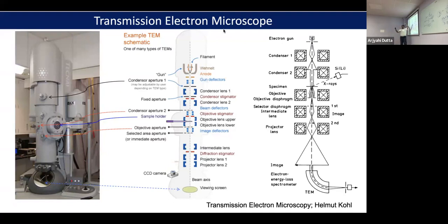So here, in any light microscope, I have one small question. We are talking about the electron microscope, and we have a multiple lens system. Here we have condenser lens 1, condenser lens 2, then the objective lens, intermediate lens, and projector lens. And that is giving us a very magnified image. It's very simple if we don't think too much.